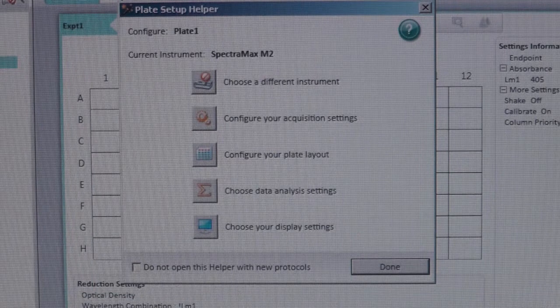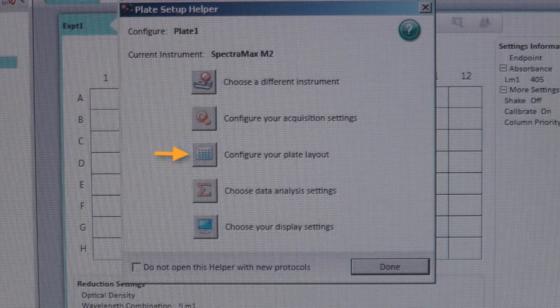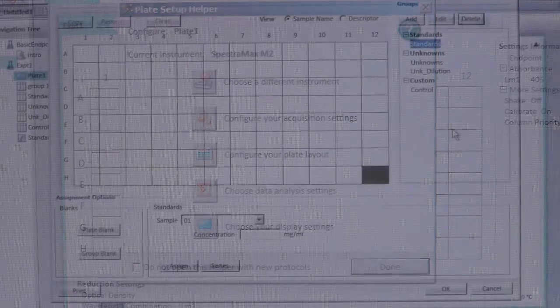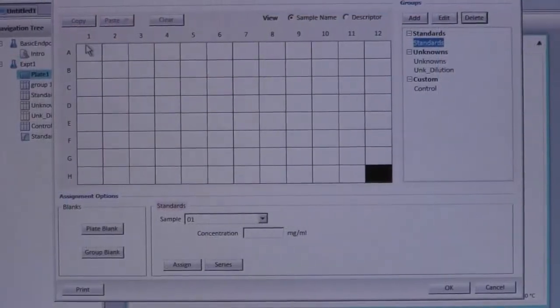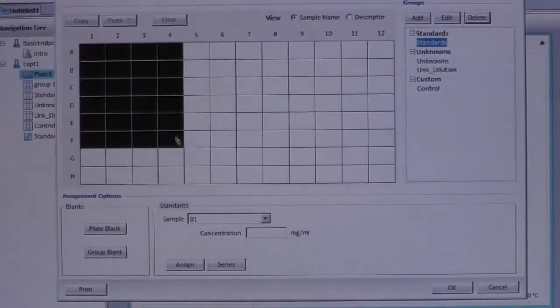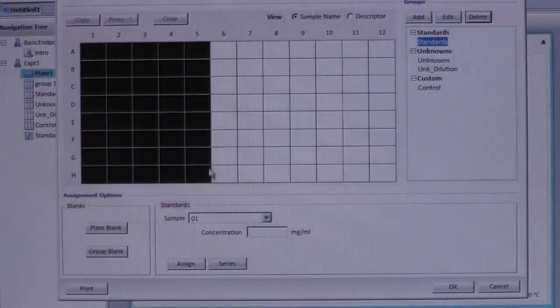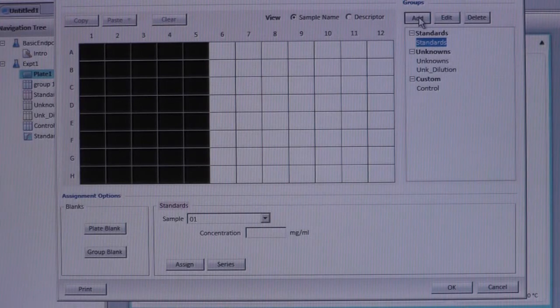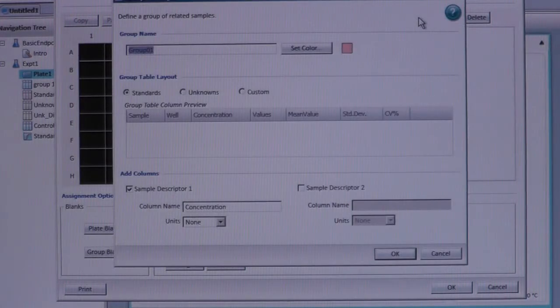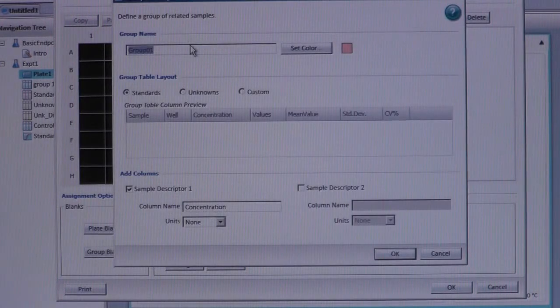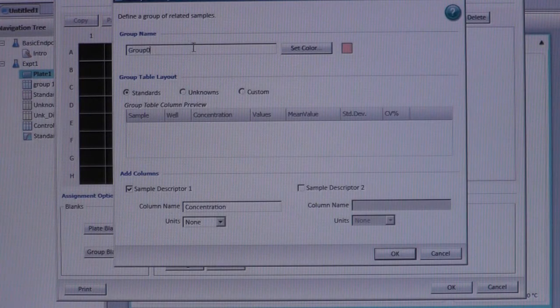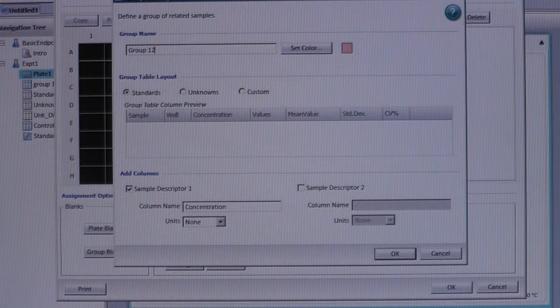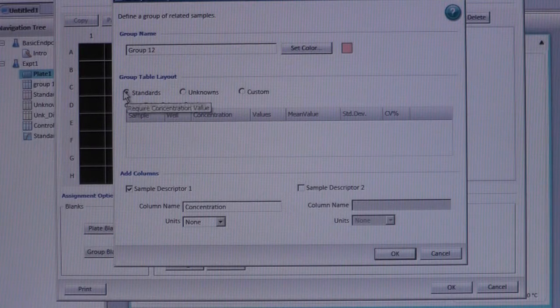After you have configured your acquisition settings, select Configure Plate Layout. This program allows you to pre-select where your standards and or samples are located. To do this, drag and select the area you would like to edit. Then click Add and enter a name for the selected area. Make sure to also indicate whether the selected area is for standards or unknowns.